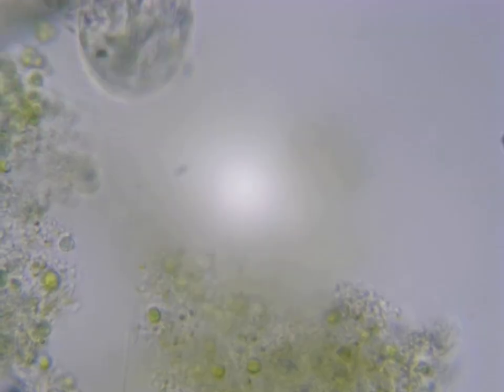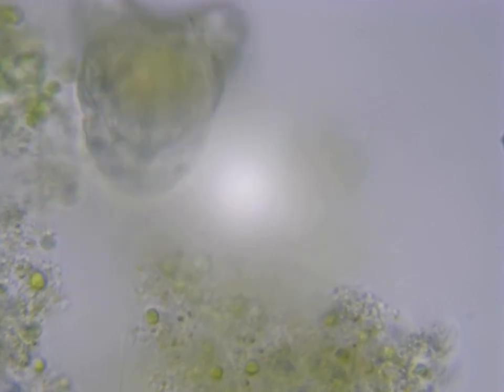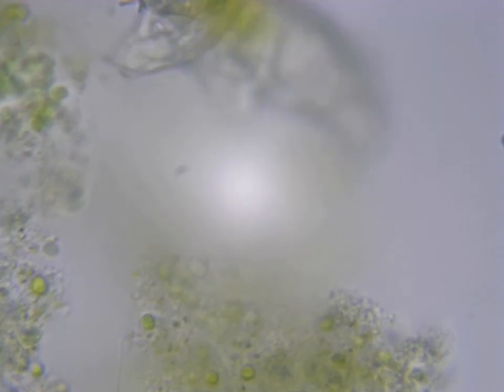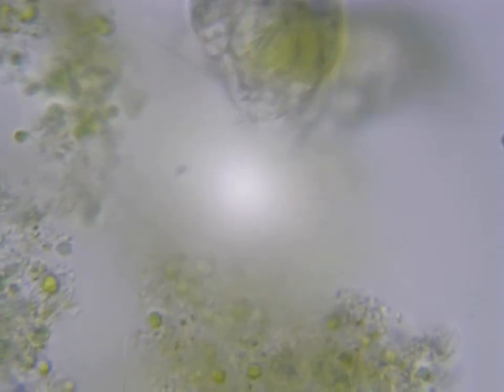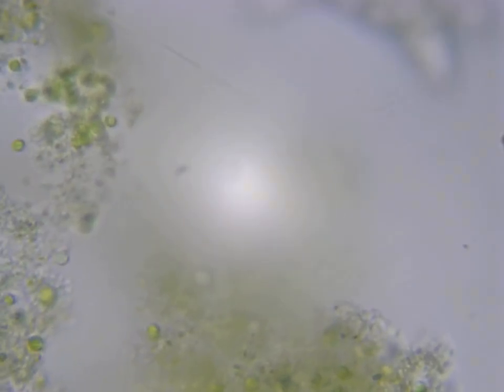The green coloration of their body is from the ingestion of algae material, and because they are typically translucent, any of the algae or plant matter that they ingest can be seen in their body. They have clawed legs, and these are used for locomotion. And they also have a nervous system. They have a digestive tract and reproductive organs, though they are highly simplified compared to larger organisms.